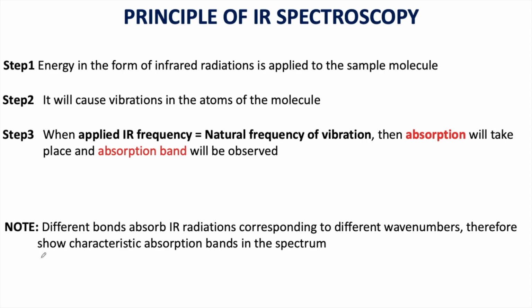Note here that different bonds absorb IR radiations corresponding to different wave numbers. Therefore, they will show characteristic absorption bands in the spectrum.